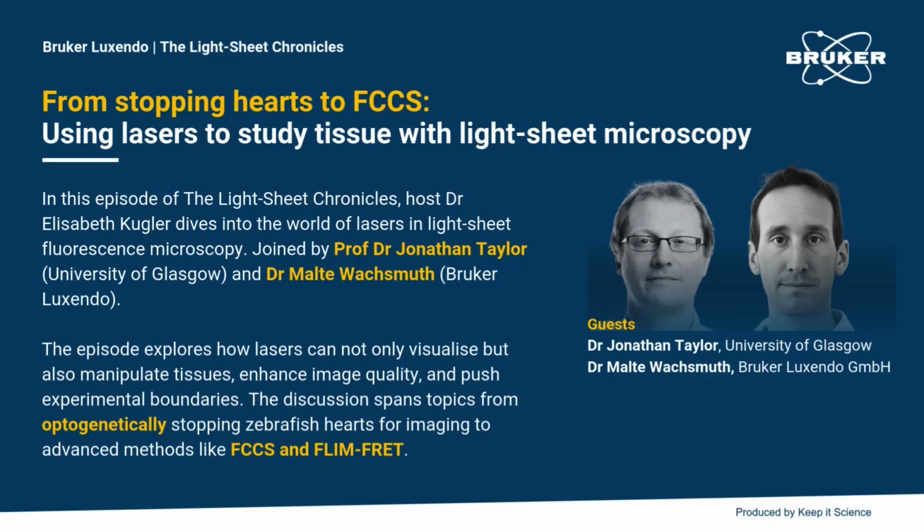No, yes, absolutely. And I think that is the beautiful thing, that bioimage analysis is really supporting the imaging in such a beautiful way now. Like you say, GPU accelerated computation, but also machine learning, AI, event-driven microscopy. There's loads of really interesting stuff happening. So I'm really excited also about the next episode of the Light-Sheet Chronicles. As I mentioned, we're going to talk about image analysis. So lots of really great science happening there as well.